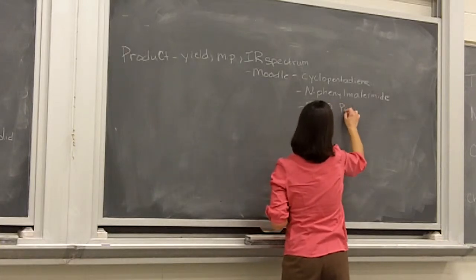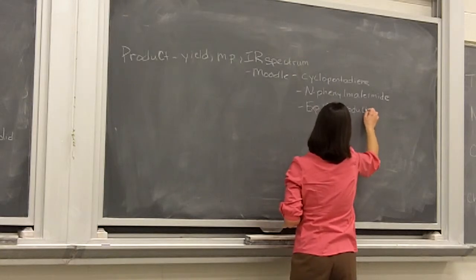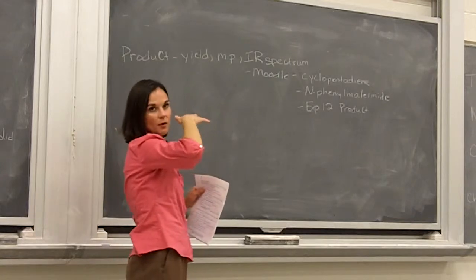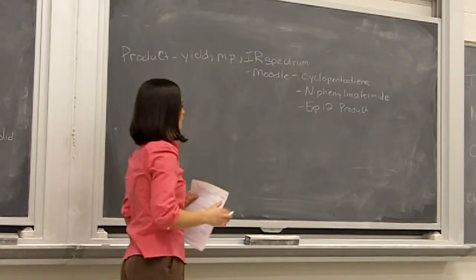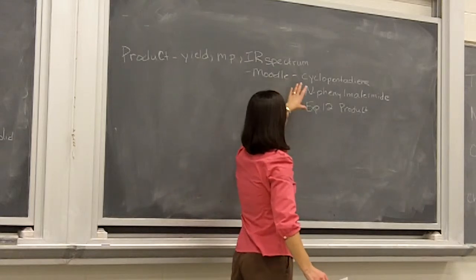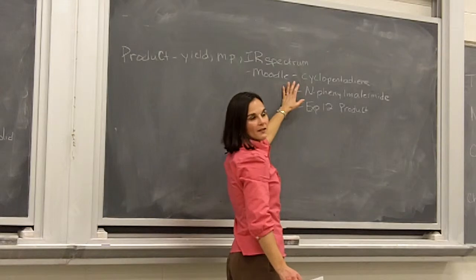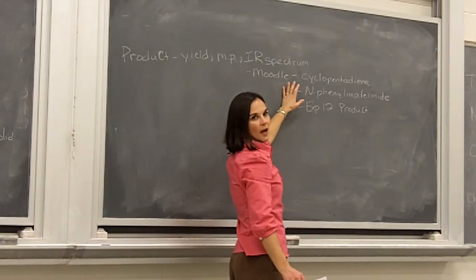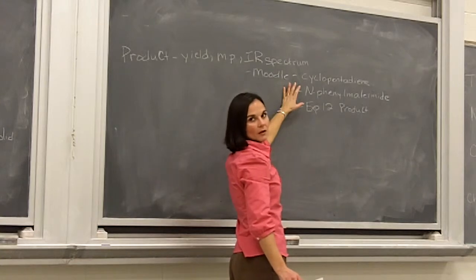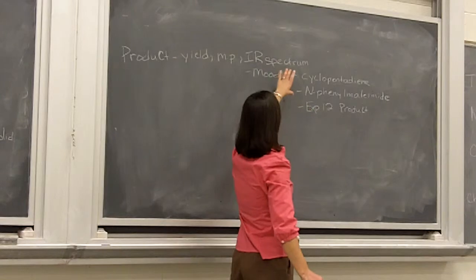So you want to compare your IR spectrum to all of these spectra that I will have posted. I'm going to list on Moodle just experiment 12 IR spectra and then include PDFs of all of them. So again, like experiment 7, you don't need to copy all of these off. Everybody doesn't need 3 copies of the standards. Just look at them and compare them for your IR table that you're going to create for experiment 12.